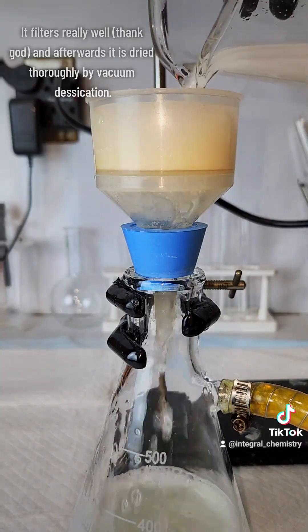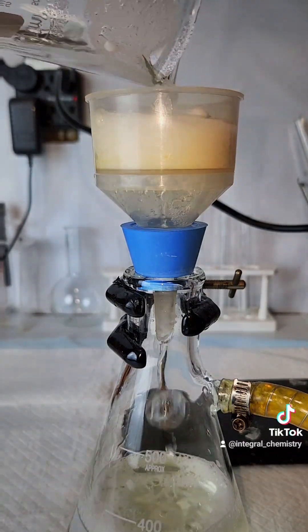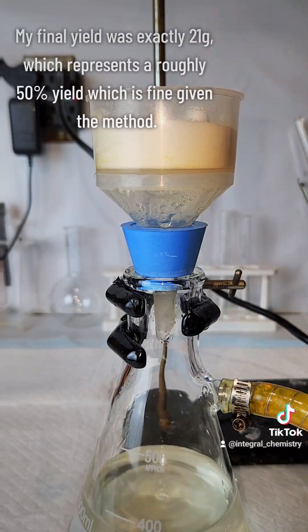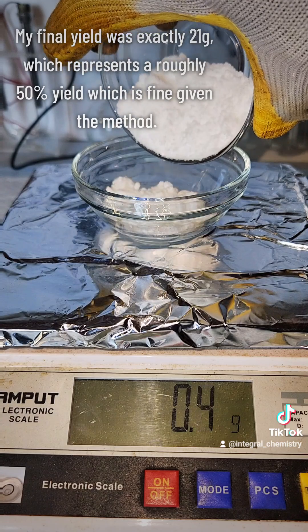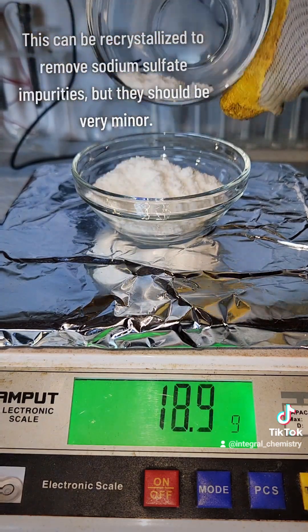I also want to note that vacuum filtration works really well for hydrazine sulfate, which I'm not used to. I'm used to every single thing I try to make gumming up my vacuum filter and having to spend hours on gravity filtration, so this was nice. My final yield after vacuum desiccation was 21 grams, which represents roughly a 50% yield, which is pretty good for this method. This can also be re-crystallized to remove the sodium sulfate impurities, but they're extremely minor and I'm not going to bother.